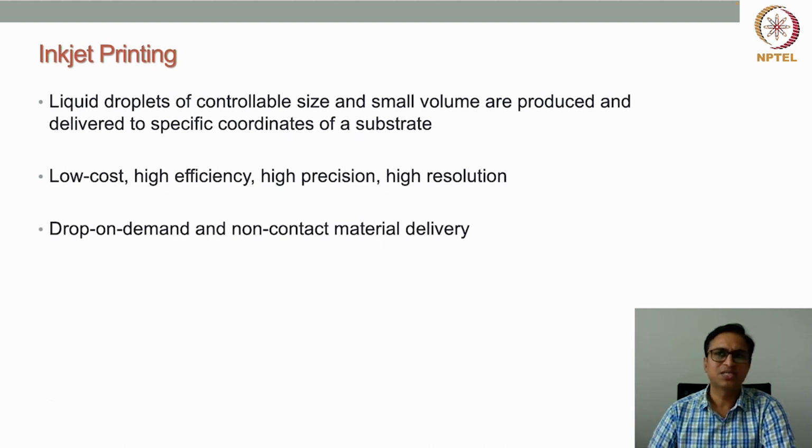And this technology is a low cost technology because most of you have seen that the printers are not very expensive. So most inkjet 3D bioprinting is actually done by modifying the office printers to suit printing biomaterials, cells, and pharmaceutical components, right?